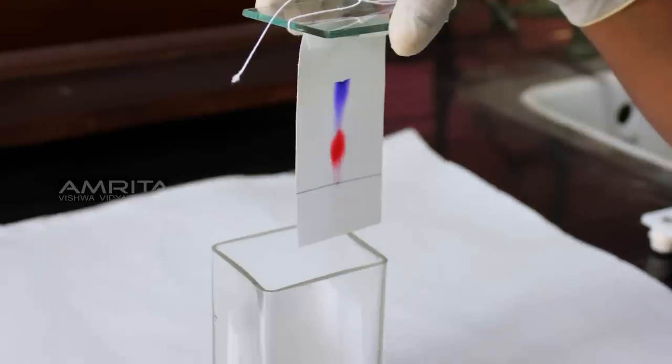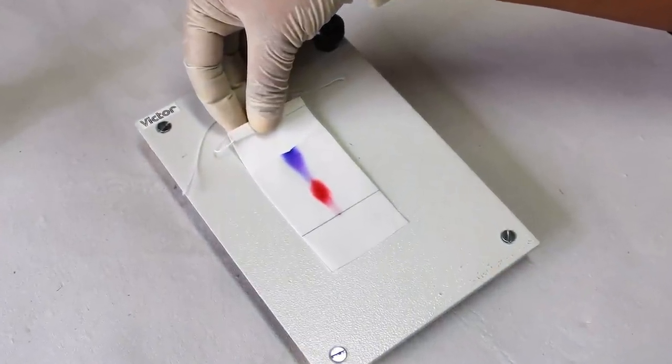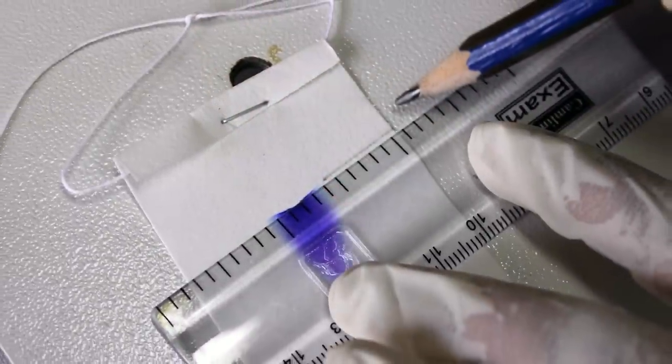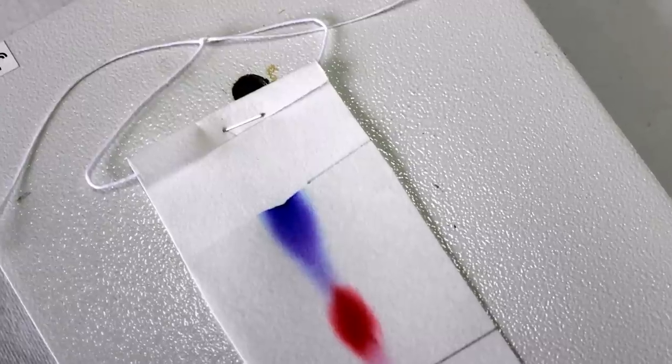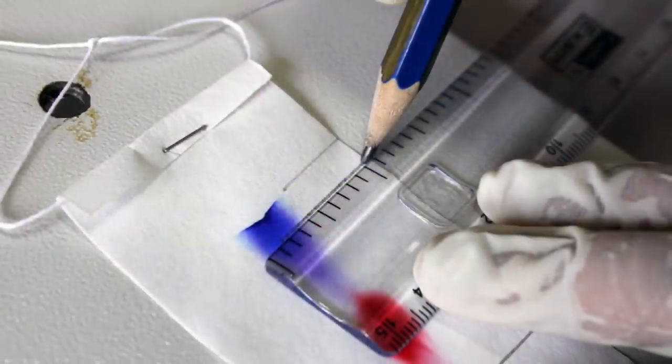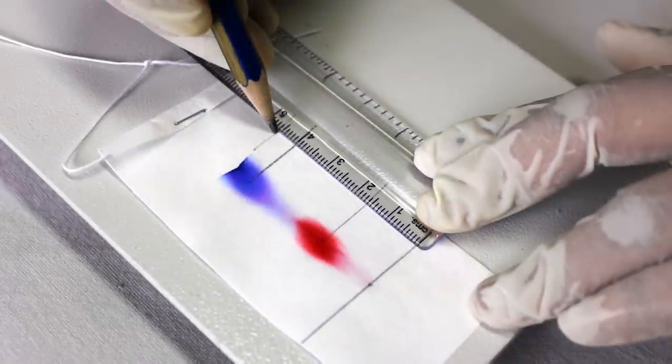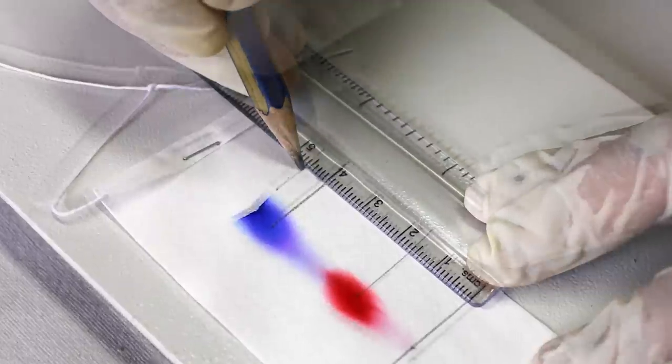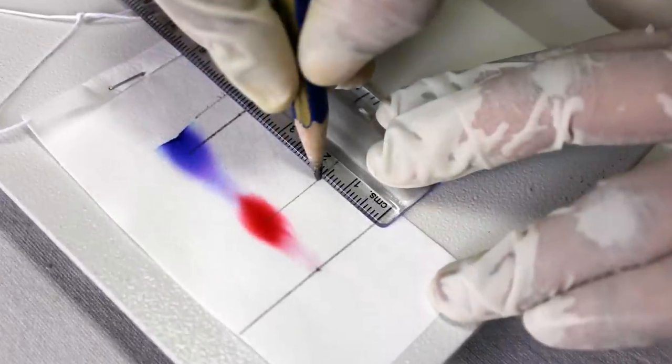Take the filter paper out of the chamber and mark the distance that the solvent has risen on the paper with a pencil. This is called the solvent front. Dry the paper and put pencil marks in the center of the blue and red spots. Measure the distance of the solvent front from the original line and the distance of the two spots from the original line.